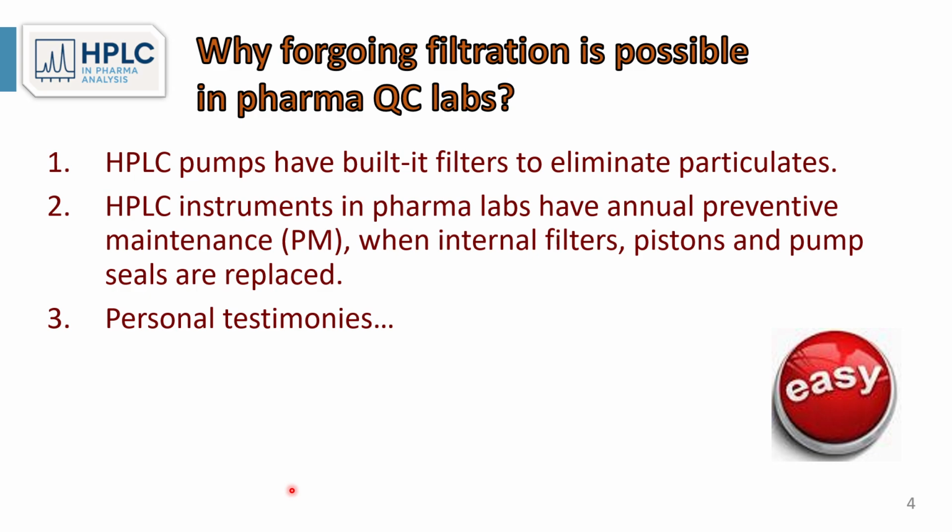Third, the most important are personal testimonies from myself and also from many QC chemists who have not performed filtration for many years, for decades, and really cannot show any evidence of any failures, premature failures between preventive maintenance. So all this filtration, we find it to be unnecessary, particularly if you have the opportunity to buy high purity buffers.